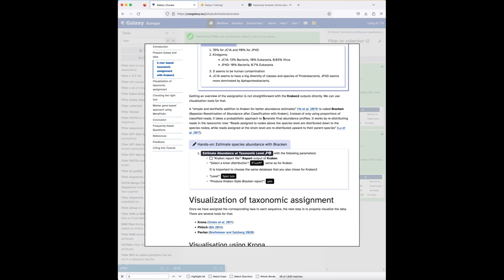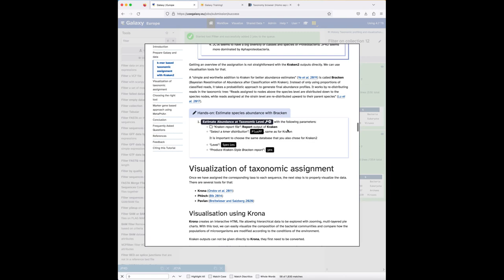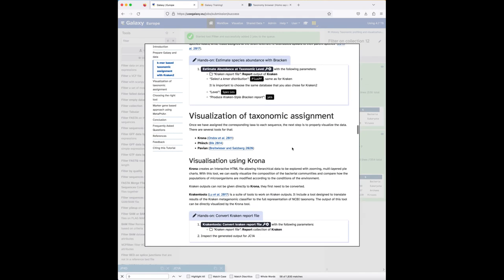For more reliable abundance estimation you can use Bracken, which applies a probabilistic approach to generate final abundance profiles and redistributes reads in the taxonomic tree for more reliable species-level results. However, the tool currently has a bug producing empty outputs, so I will skip that part — we hope to fix it in the coming days.